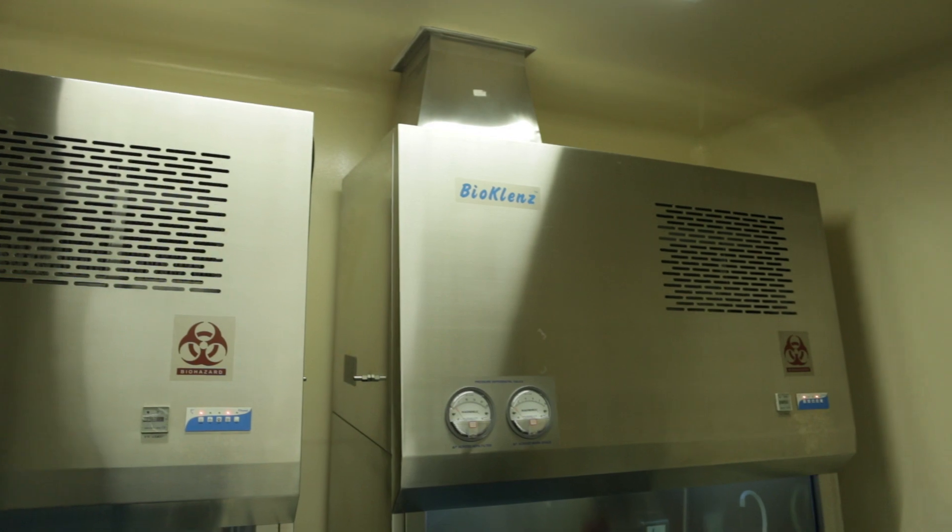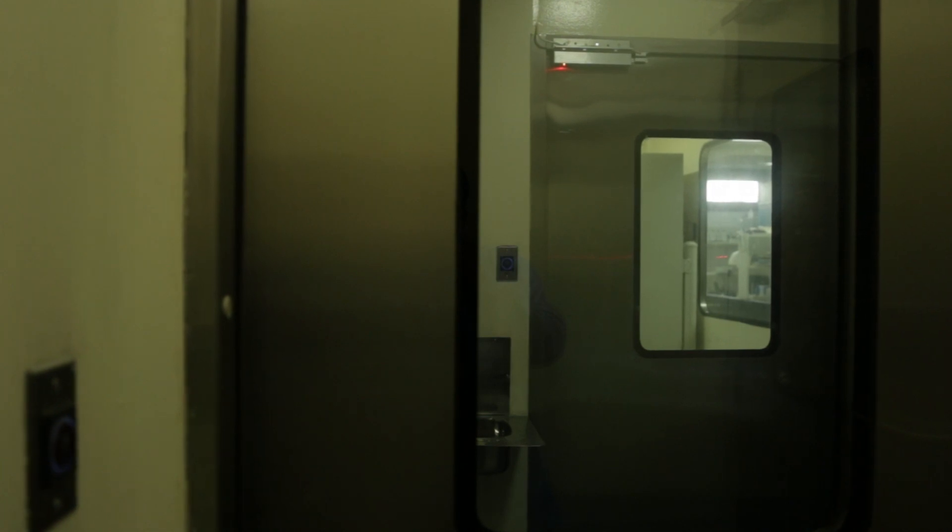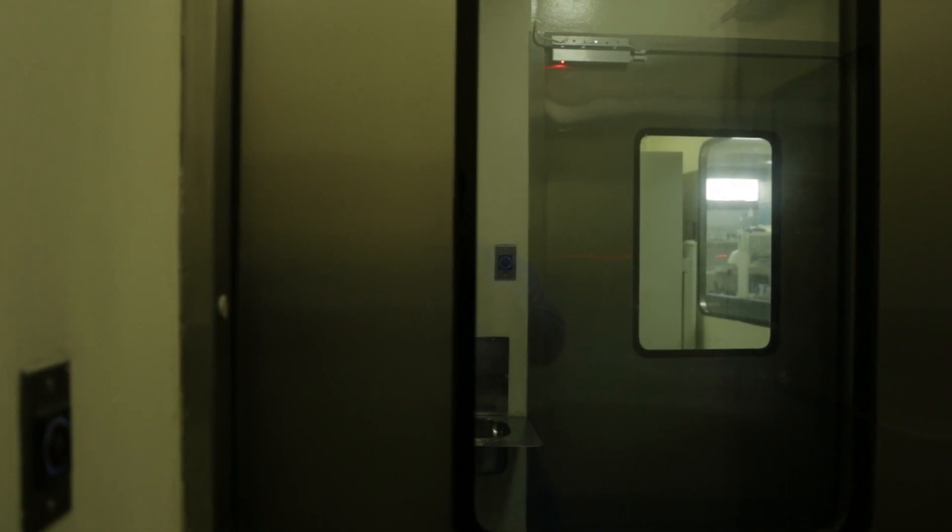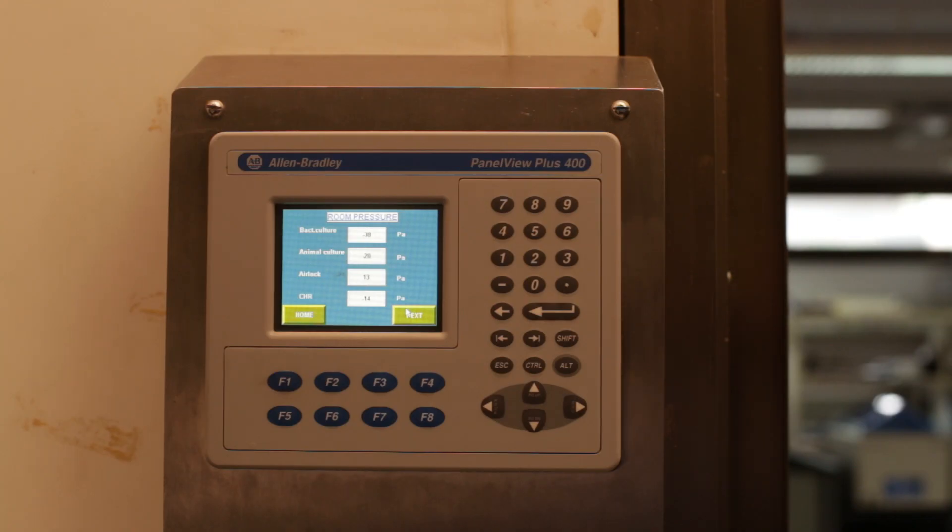Biosafety level 3 facilities are used for conducting work on microbes that can cause serious or potentially lethal disease through inhalation. Some of the requirements for BSL3 labs are double door entry, negative ventilation, and use of protective wear.